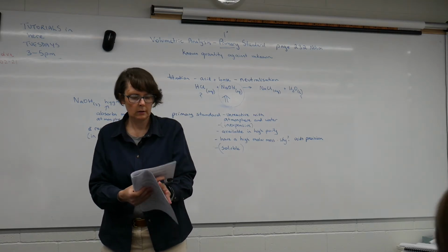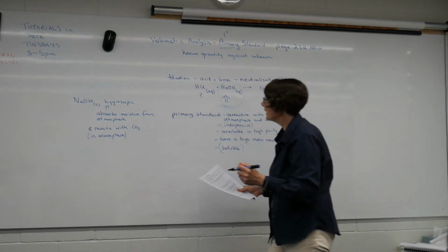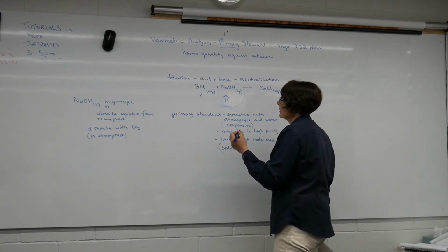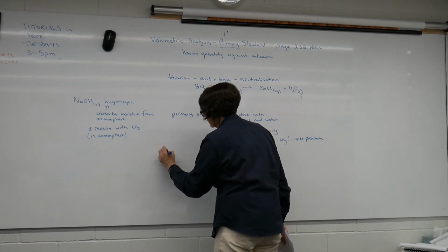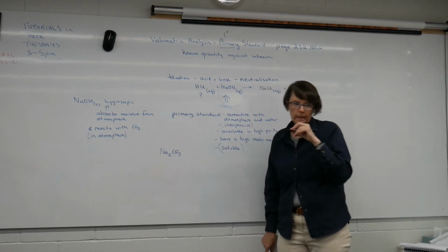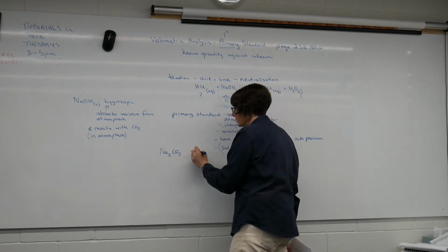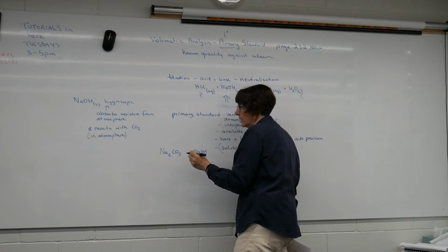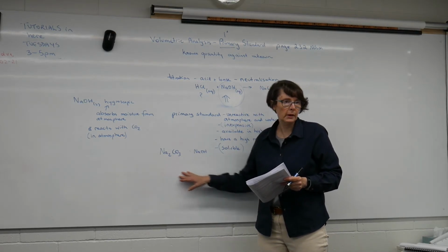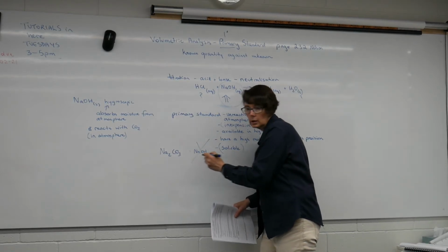Sodium carbonate. Which compares quite favourably too, doesn't it, with sodium hydroxide as far as the molar mass is concerned. This one's going to have a much higher molar mass than this one anyway. But we can't use this one because it's just not suitable.